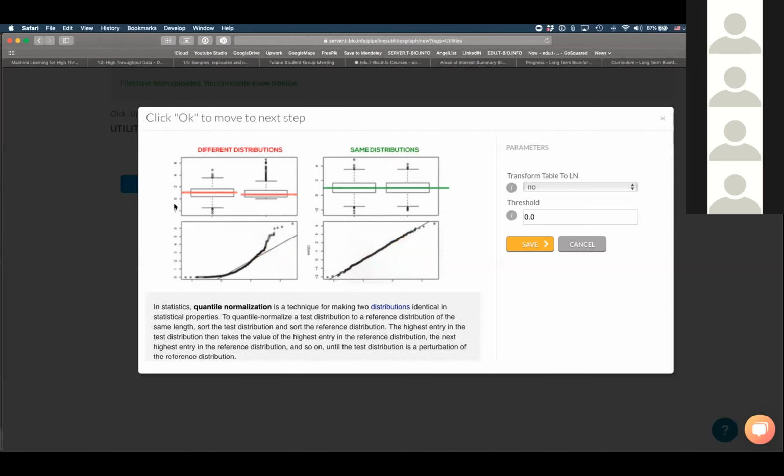So now that we've talked about the box plots, you can see that transformation of our data set is going to help us compare the different conditions in a more accurate way. Because our conditions are represented by a number of individual samples, we want to kind of normalize that variance within each group. So if you look at here, you can see that the median and the distribution of samples are different, and we want to align them.